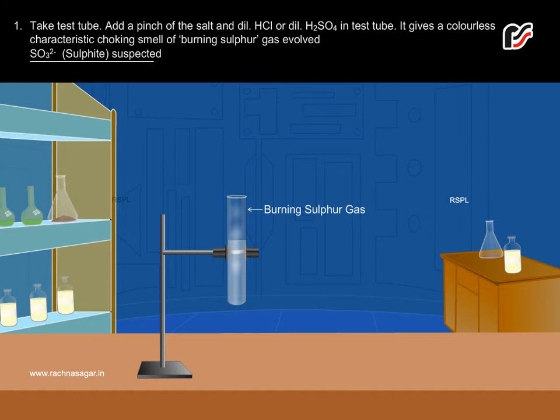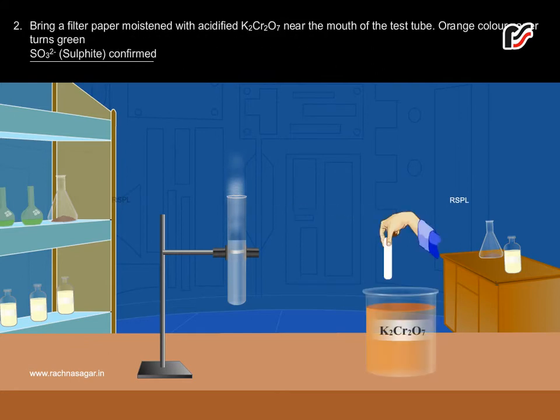SO3²⁻ Sulphite Suspected. Bring a filter paper moistened with acidified K2Cr2O7 near the mouth of the test tube. The orange color paper turns green.